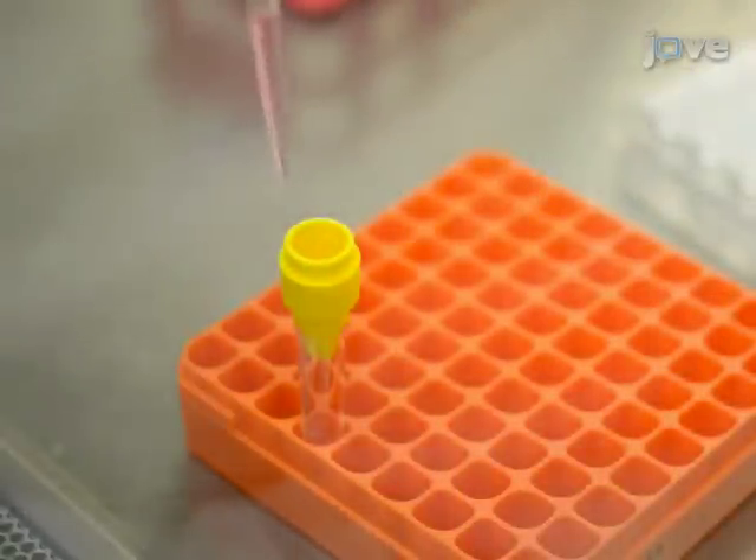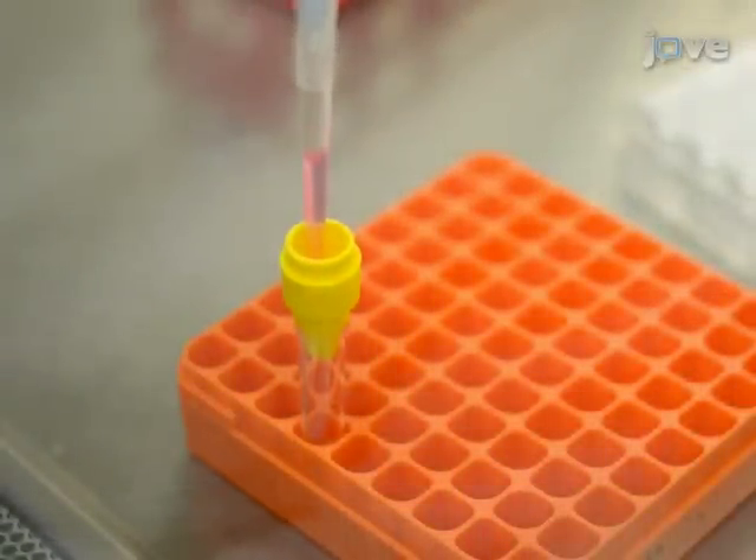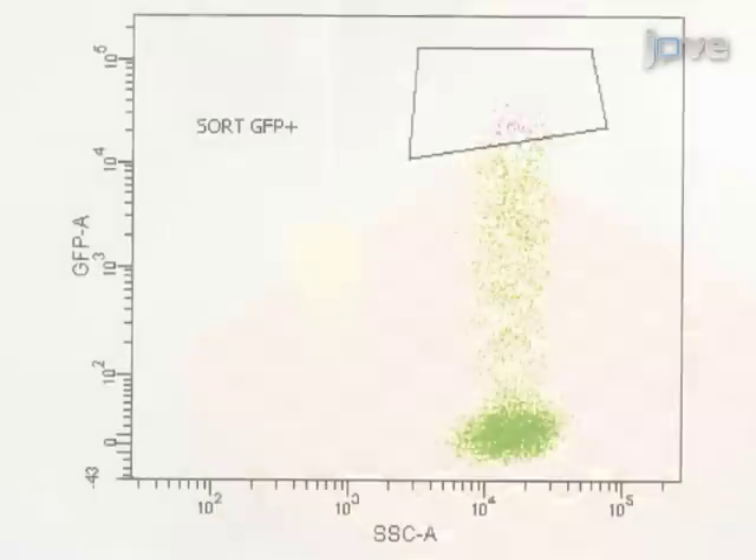Pass the cells through a sterile 50 micron filter into a FACS tube, then FACS sort the top three percent of GFP positive cells in order to enrich for cells that received high levels of the plasmids.